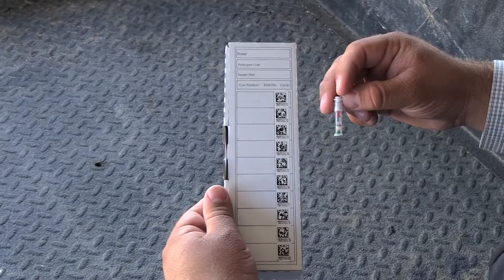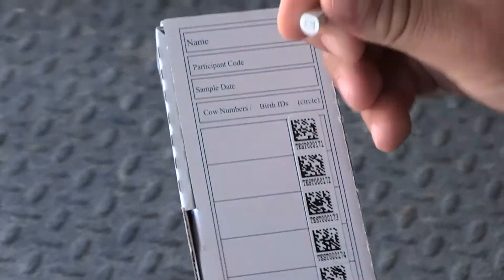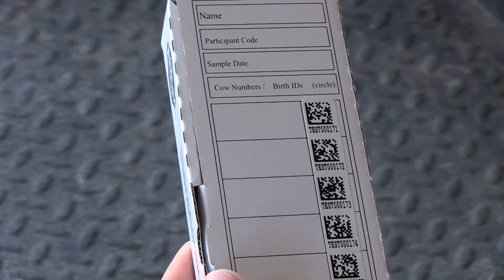We put that in the box of tissue collections. We're going to match the label on the TSU to the label on the box and put the tissue collector inside the box to store it and send it back for future reference.